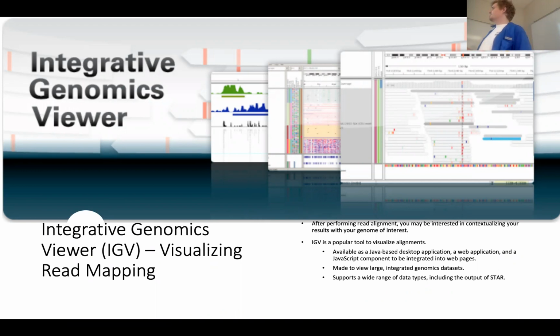After you perform your alignment, you may be interested in contextualizing your results with your genome of interest. In this case, we can see where our reads of interest align on our genome. We can also include mapping information such as the proteins, where they begin and end, so you can contextualize that this read is probably related with this protein.